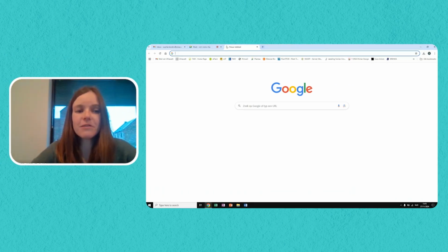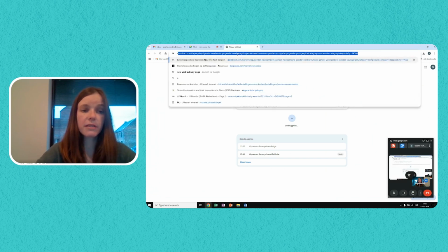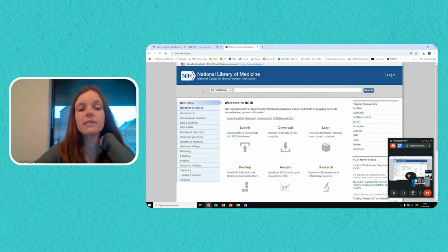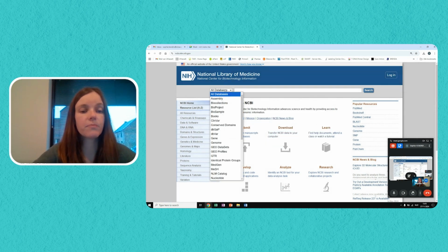Hello everyone. In this demo session, I will show you how to design primers for a gene of interest, and we will do this using the NCBI website. You can open the website, and then here, instead of all databases, you will select gene.